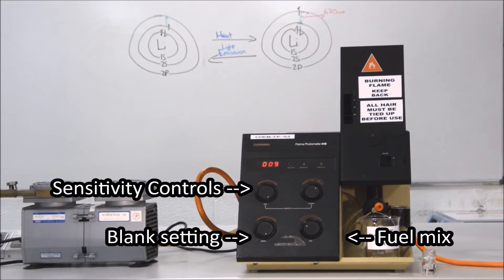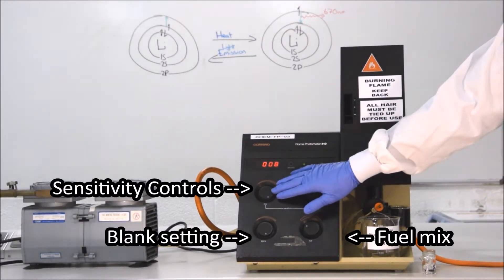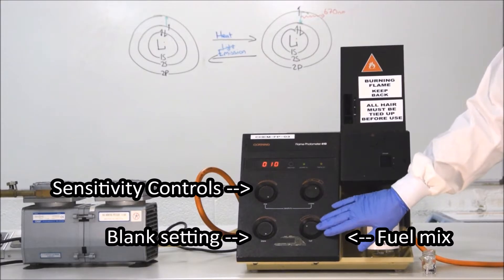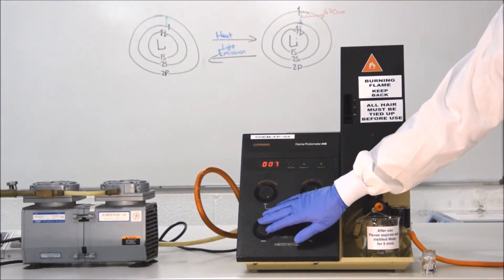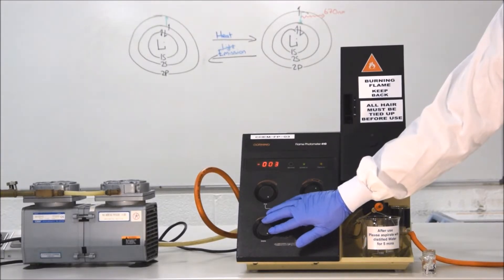This model also has four control wheels. The top two control the sensitivity, which we will come back to. The bottom left one allows us to zero it, and the bottom right controls the fuel mix. We probably won't need to adjust the fuel mix since the machine will already be set up for you.